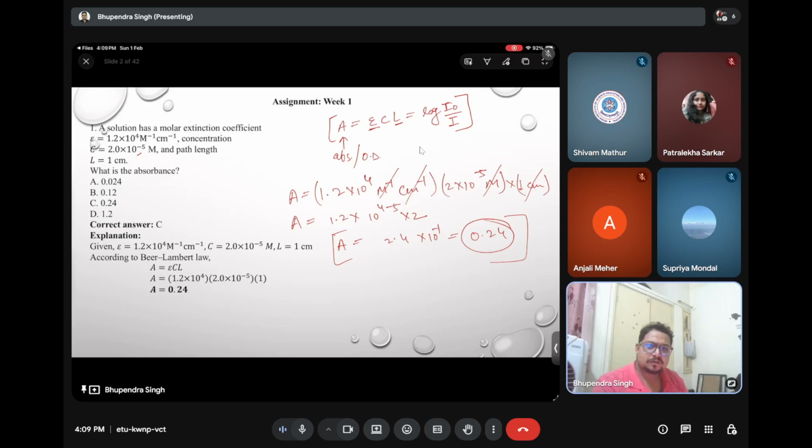You can see the actual absorbance data of my sample, my protein which I have labeled with some fluorescent dye. Okay, I think this is fine.